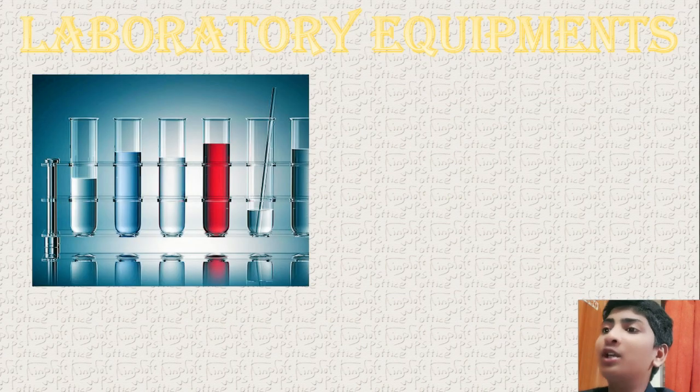Today I am going to teach you about laboratory equipment used in chemistry. The laboratory equipment are the main, essential things needed for chemistry reactions and solutions: to mix any solutions, to hold any solutions, to heat the solution. These are the essential or the basic parts of chemistry.